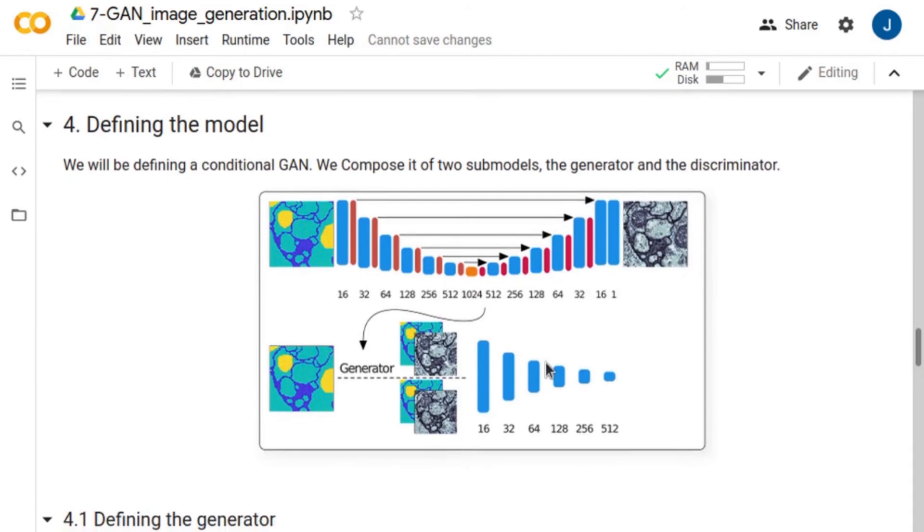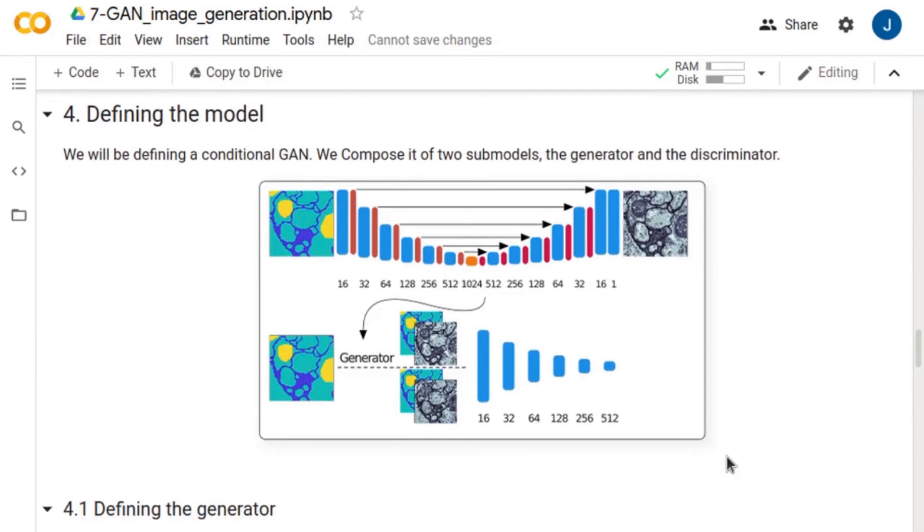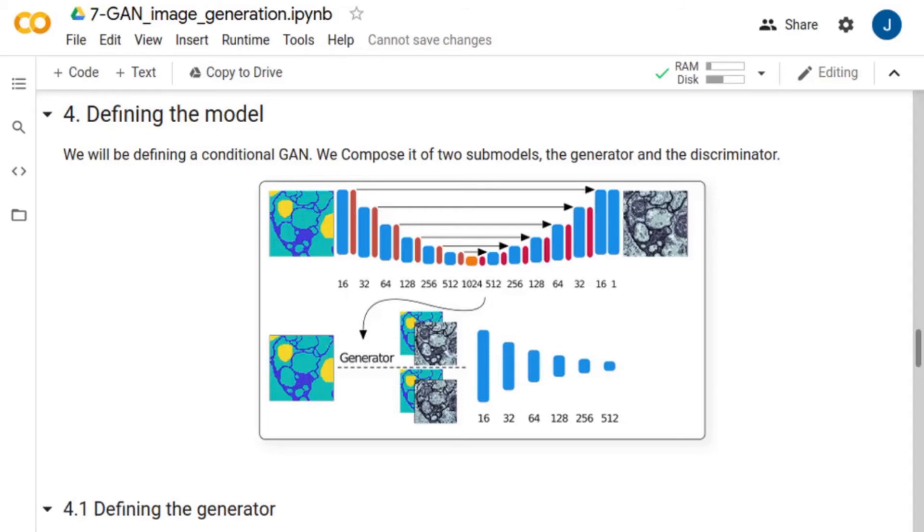Our network is composed of a generator that learns the mapping relation between the input mask and corresponding cell image, and of a discriminator that determines whether the generated image looks realistic or not, according to the experimental data.